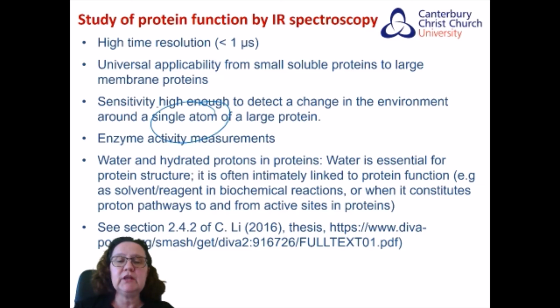So it is really quite useful to measure activity, for example, enzyme activity measurements, or to pinpoint how the structure of sections of the molecule, down to a single atom, influence or change when a reaction is performed.